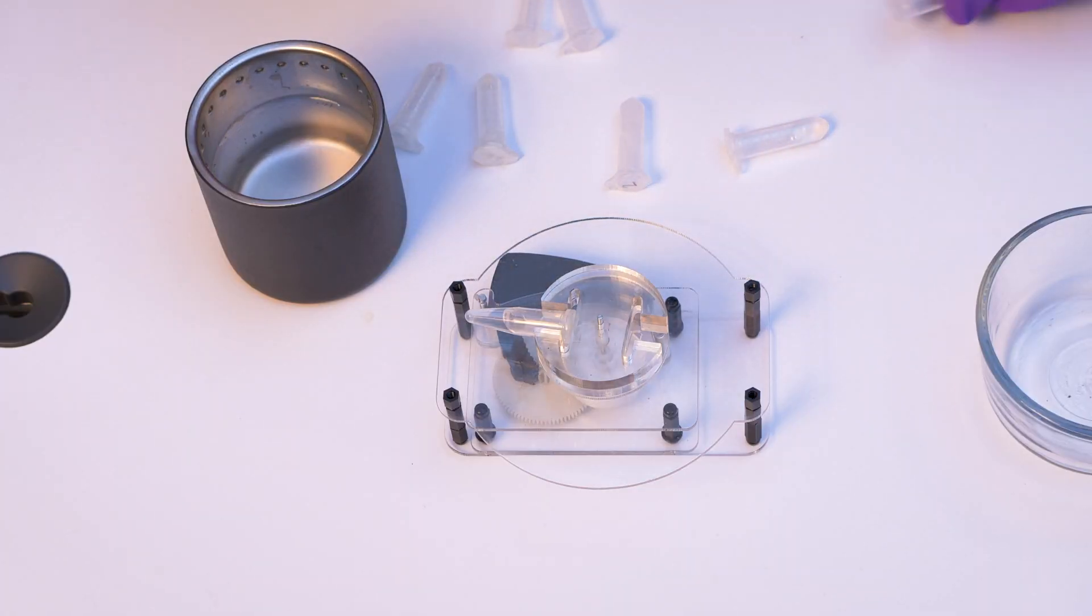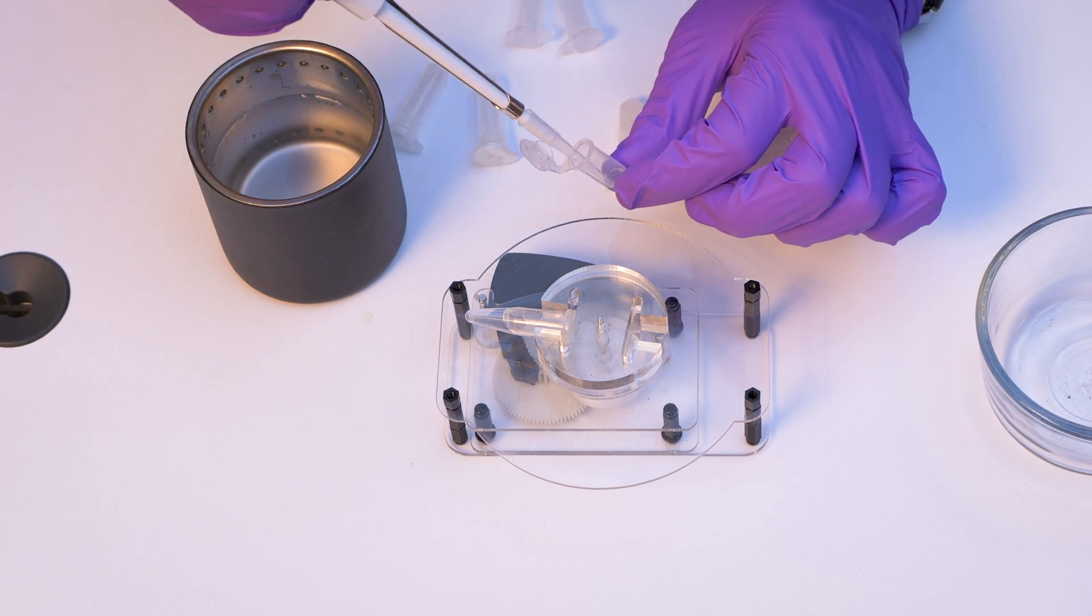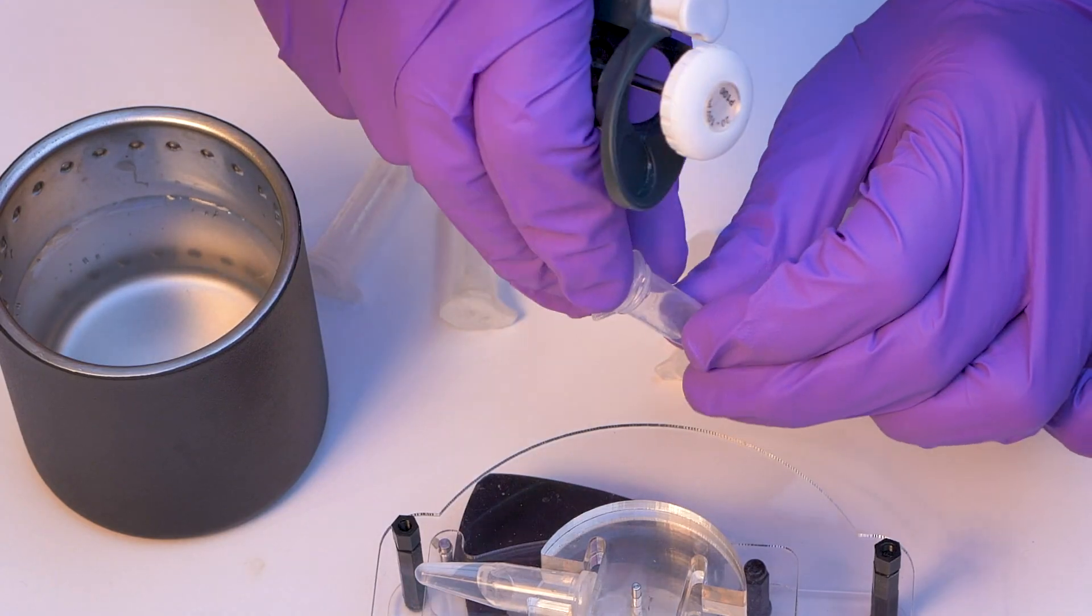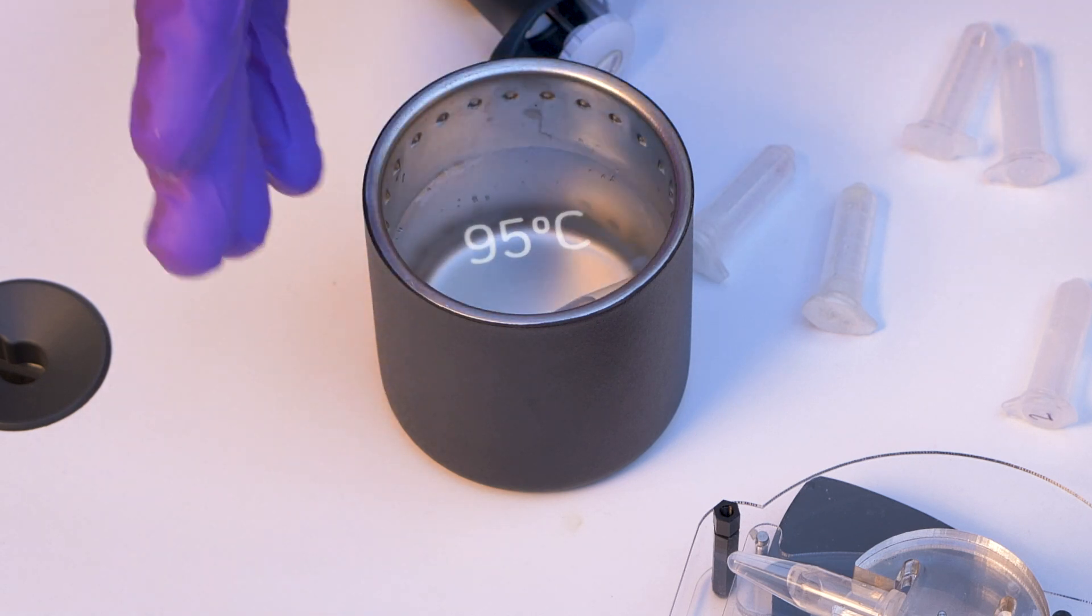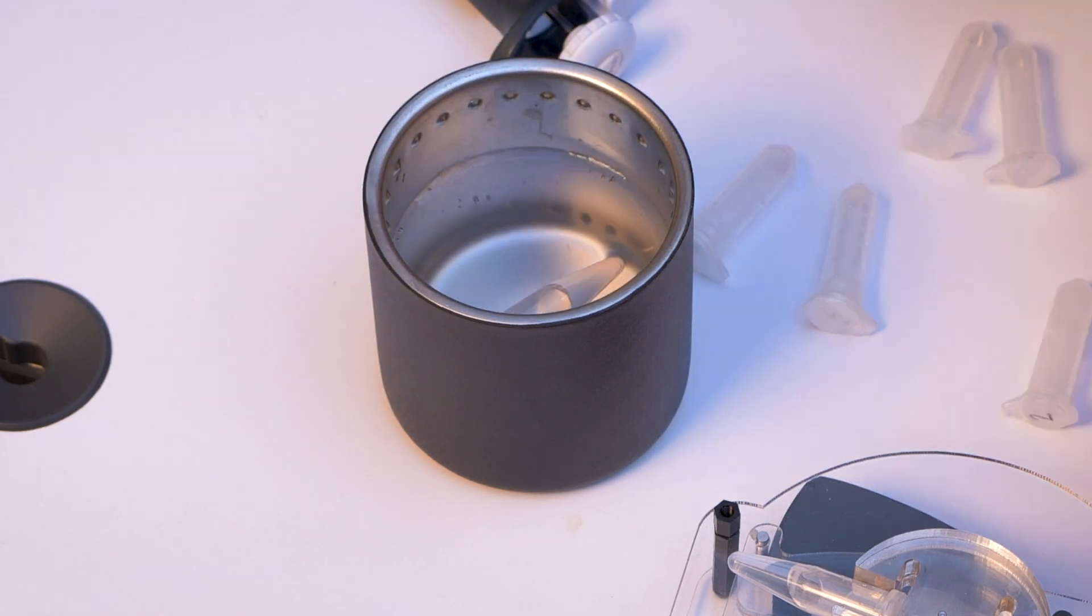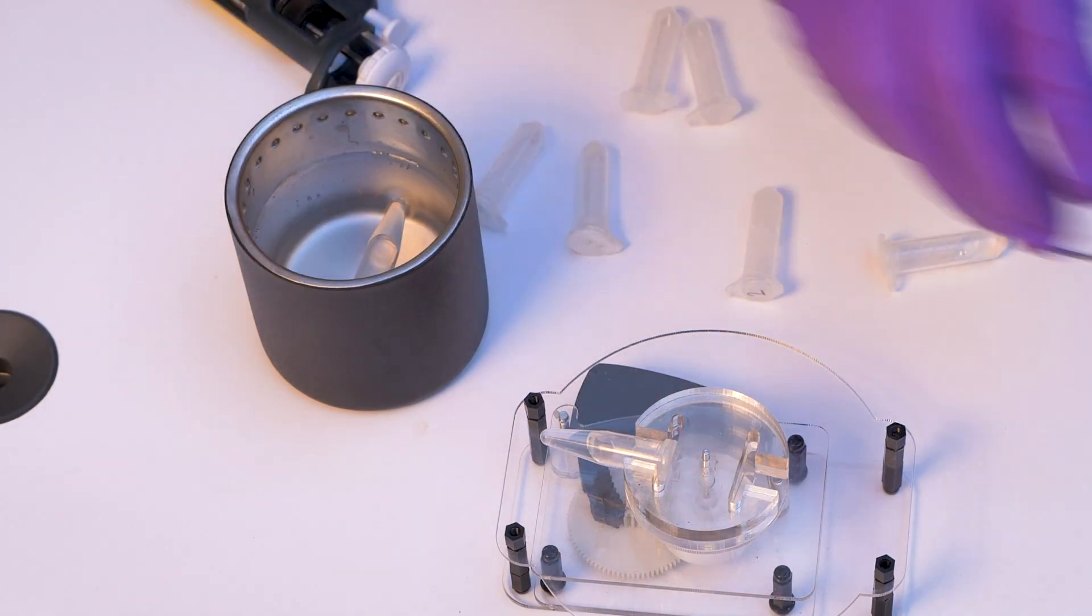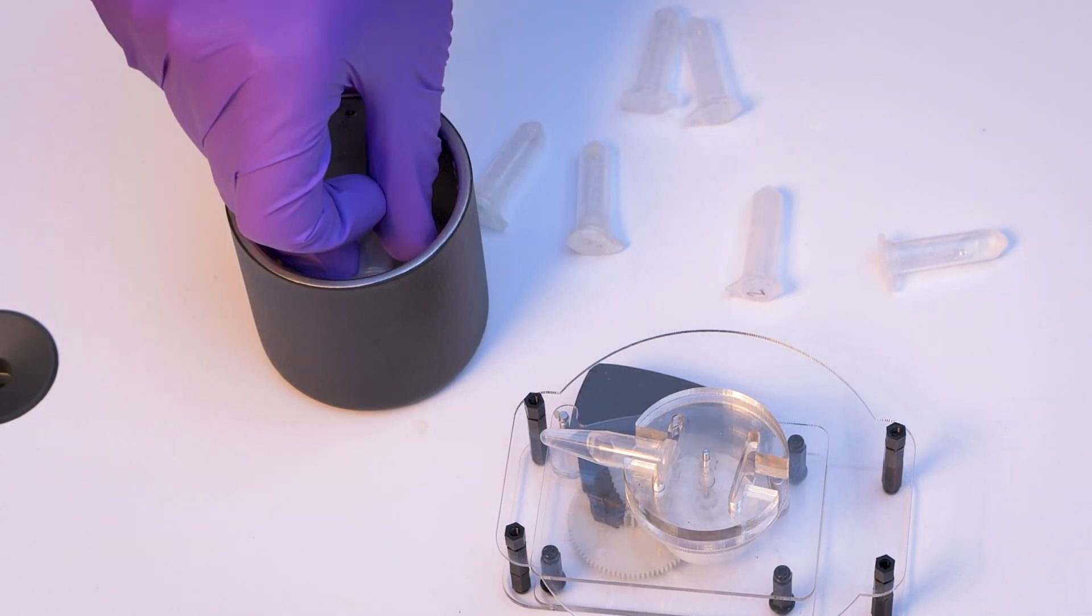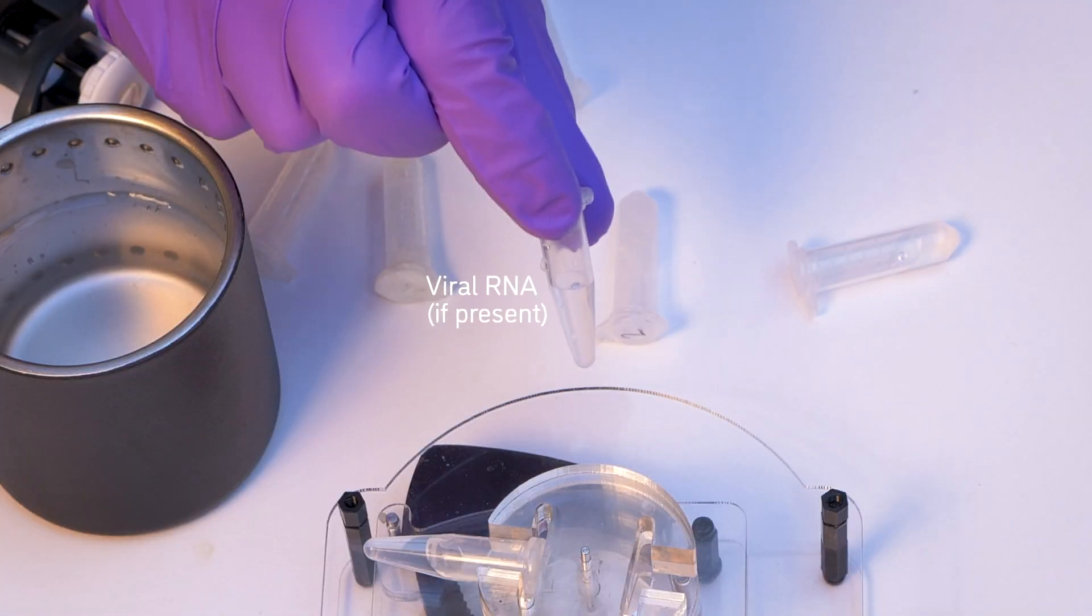It will break open the cells, releasing the viral RNA, which is what we are going to detect in the end, as well as keep that RNA from being degraded. So now that we have added this reagent, we're going to boil it in water at 95 degrees Celsius for five minutes. After this, the sample is completely inactivated, so there's no infectious virus left. But the RNA of the virus is stable.